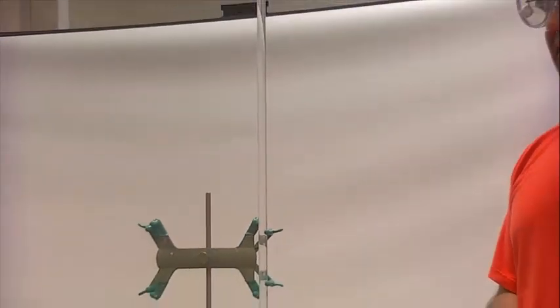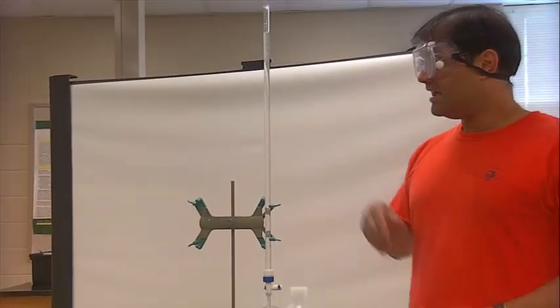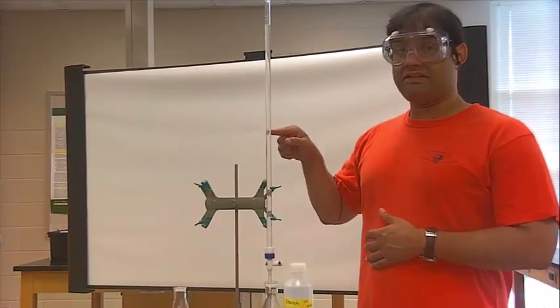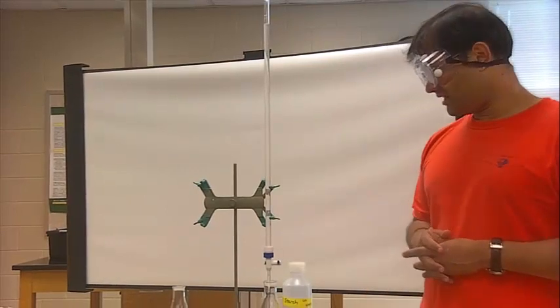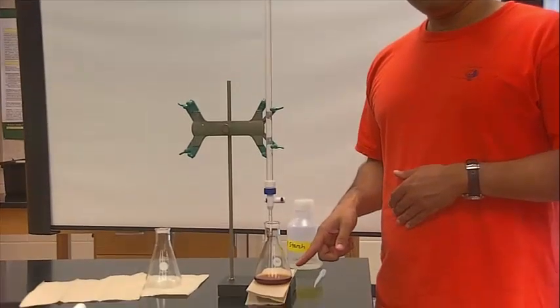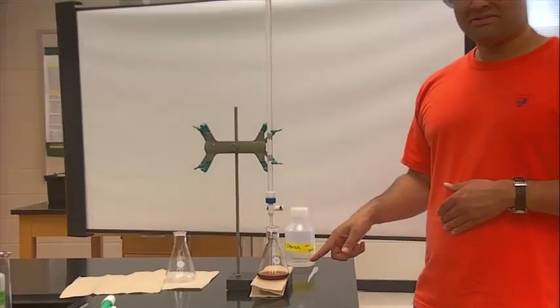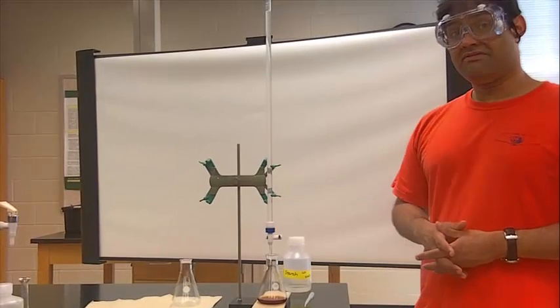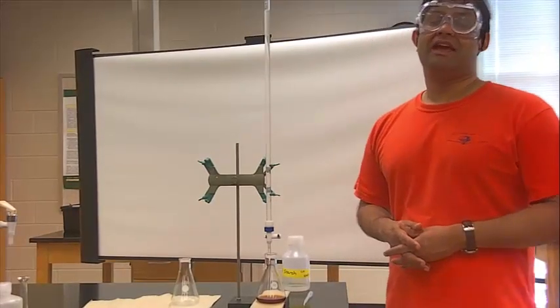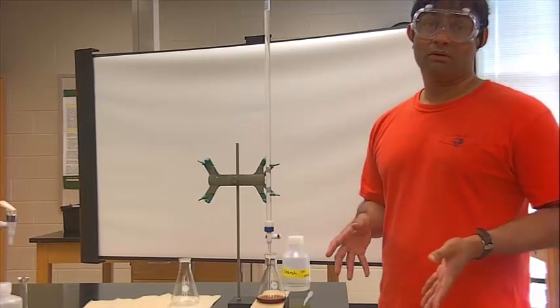thiosulfate. Now, the equivalence point occurs when the exact volume of thiosulfate reacts with all of the molecular iodine that was produced in the reaction generated in the flask. To get the equivalence point, we had to calculate that using pre-lab question 4.